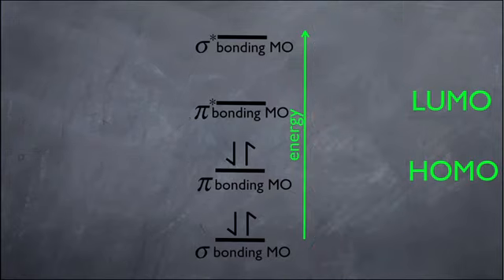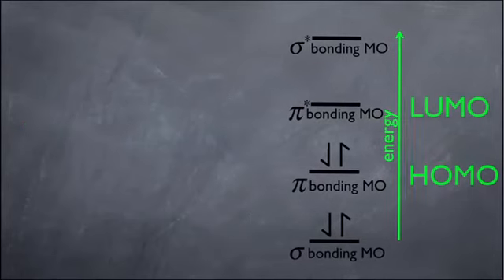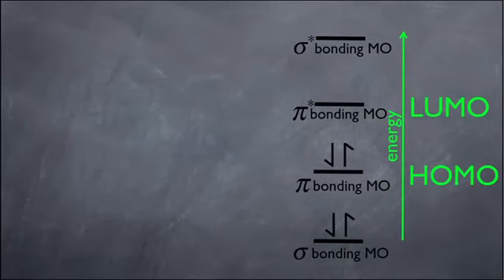This becomes yet another way to characterize our conjugated system. That diagram is basically, like I said, a way to describe a conjugated system. So this is what's going to help us understand how the UV spectrometer works. Remember, all of these machines, we have to understand, number 1, how the machine works, and 2, how to read the data. For this machine, we're going to see it's harder to understand how it works, but easier to read the data. But if you followed me so far, you're going to be able to understand this machine. So here's what happens.